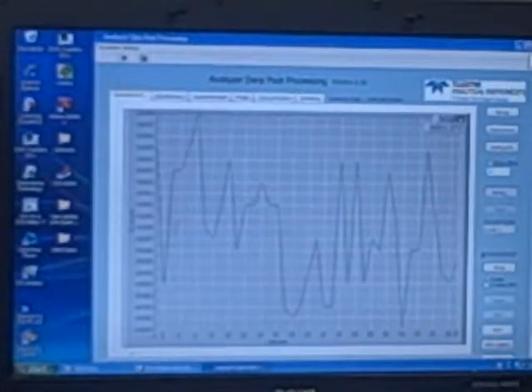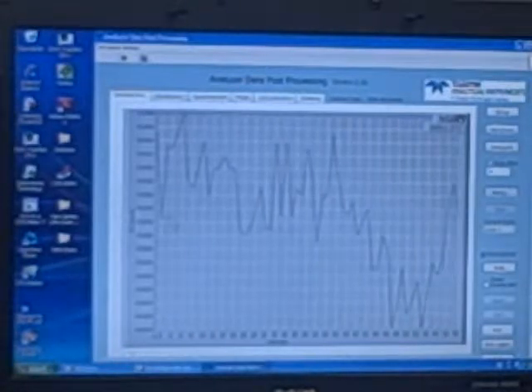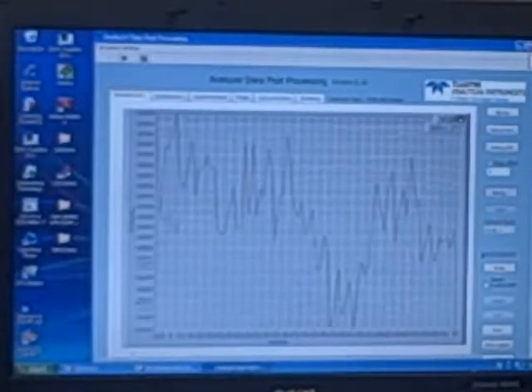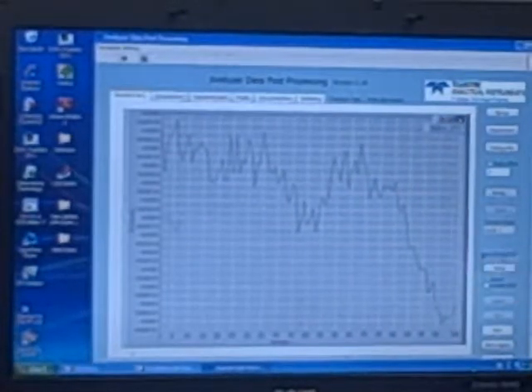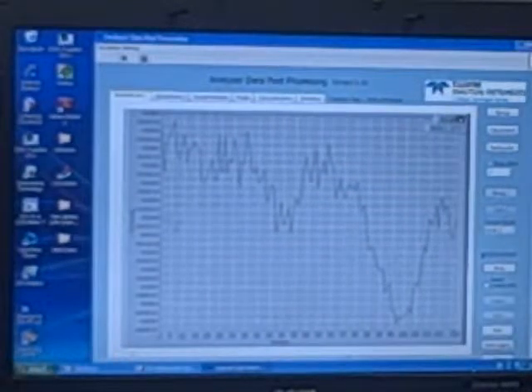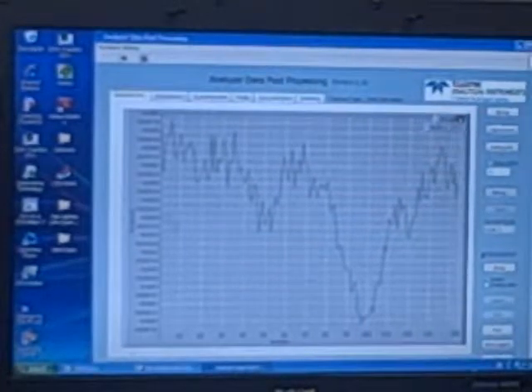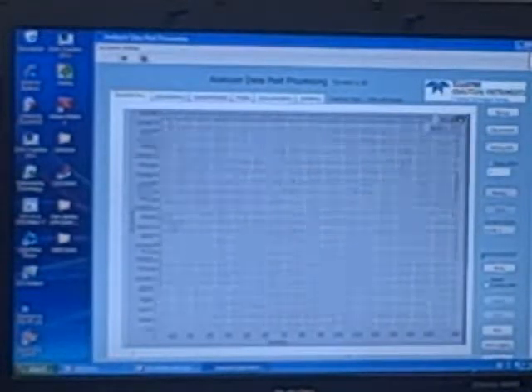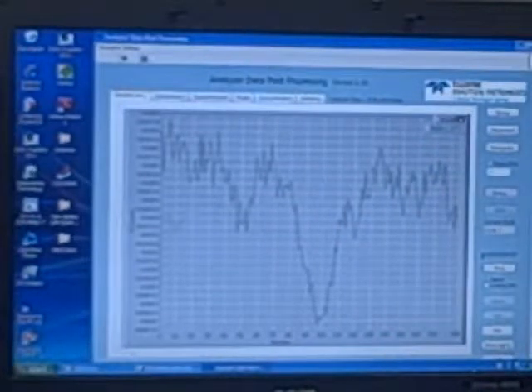However, the data will not be saved until the beginning of the next cycle, because it doesn't make sense to make any setting of the valve switching halfway through the cycle. So data will not be saved until the beginning of the next cycle. And you also look at the blue bar. That tells you the status of your current cycles. If you ask for 2 cycles, when 1 cycle is done, it will move to the middle. So it's a percentage of the cycles already saved versus the number of cycles you desire to save. Okay? Now we're still working on number 1. And we have to wait.